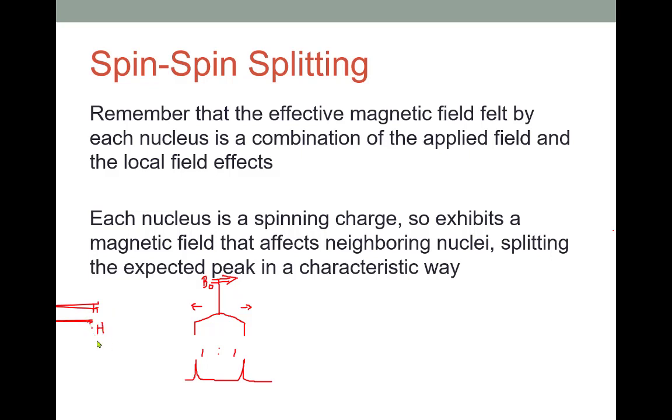When we see this kind of splitting, that tells us that the hydrogen we're interested in here is next to one hydrogen neighbor. Okay, and these are other things, whatever they are, not hydrogens. So the magnetic field of that neighboring hydrogen is influencing the environment felt by our first hydrogen. I'll show you more diagrams like this in just a moment, but what we're ending up with now is a situation where we can follow a mathematical tool that you may have heard about in a math class called Pascal's triangle to determine our splitting.